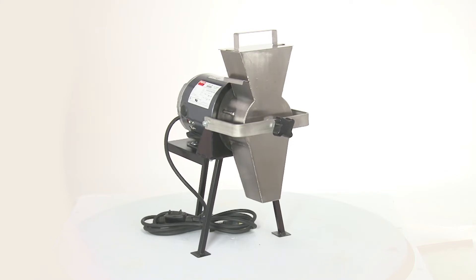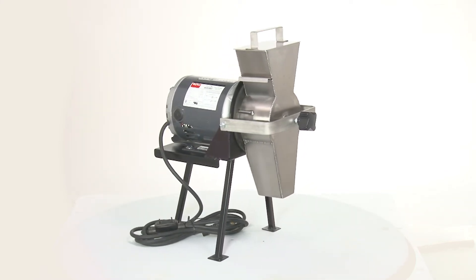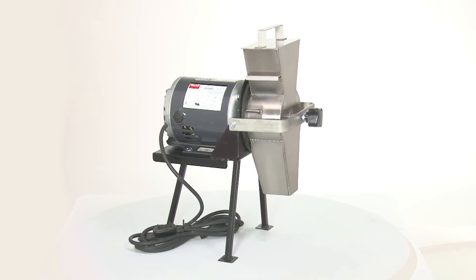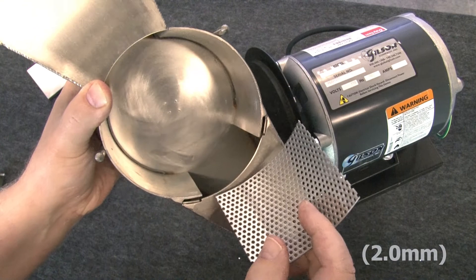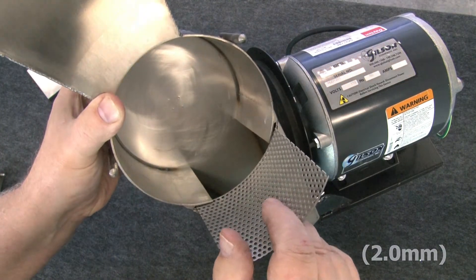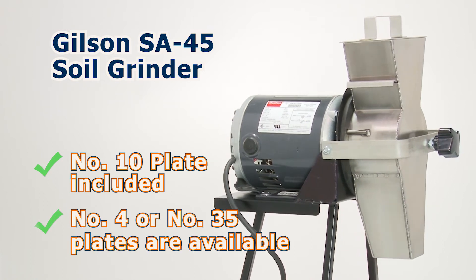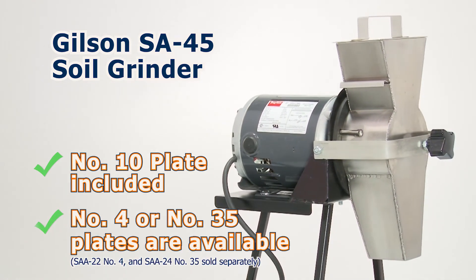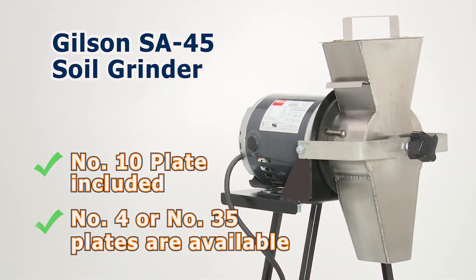The rugged and reliable direct drive motor and the grinding unit are mounted on a sturdy steel tripod stand. The included number 10 perforated plate retains oversized particles, but number 4 or number 35 sized plates are available as alternatives for your unique soil grinding needs.